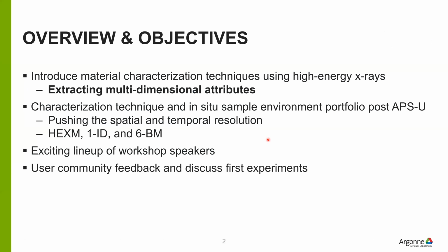So the objective of the slides that I'm going to present today is to introduce several materials characterization techniques using high energy X-rays that have been developed at 1ID in collaboration with many users and expanding those programs.